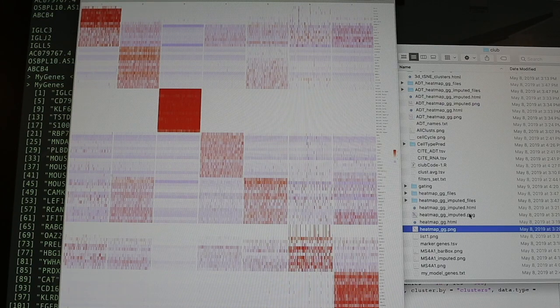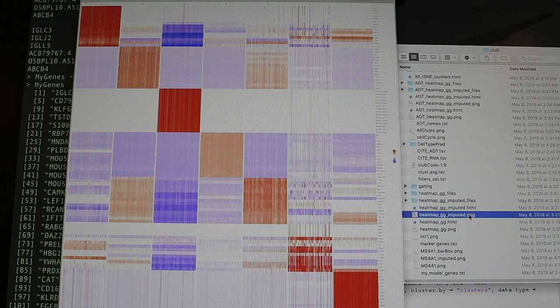And after imputation, if you wanted to impute data, it would look something like this. So the zeros would be filled. Since with 10x Genomics the coverage is low, a lot of cells won't be captured in the sequencing method, so it would be zeros instead. So you could impute the data. There's a lot of methods to impute the data. I guess you guys do that too a lot. We do that too. Yeah.